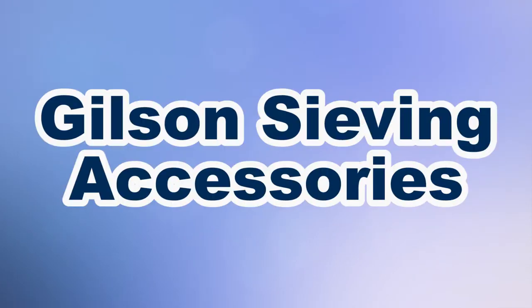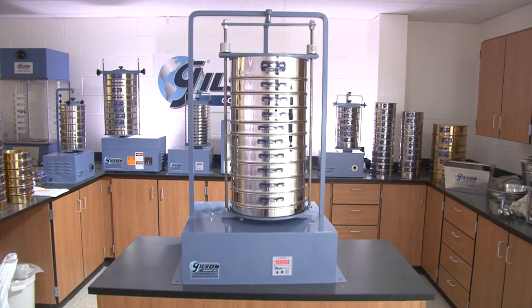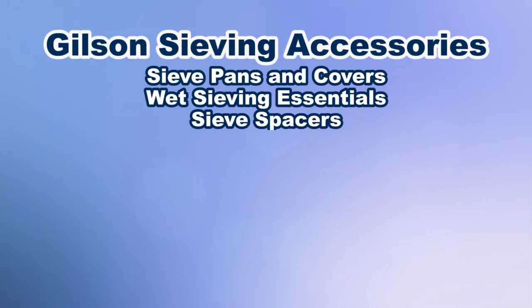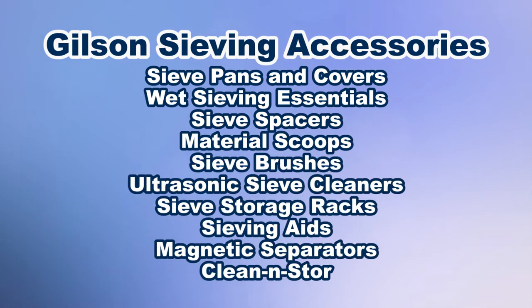When you need to simplify sample handling, increase efficiency, or streamline testing procedures, then Gilson is the right choice. Gilson has every sieve accessory you need to make your gradation analysis run smoothly and effectively.